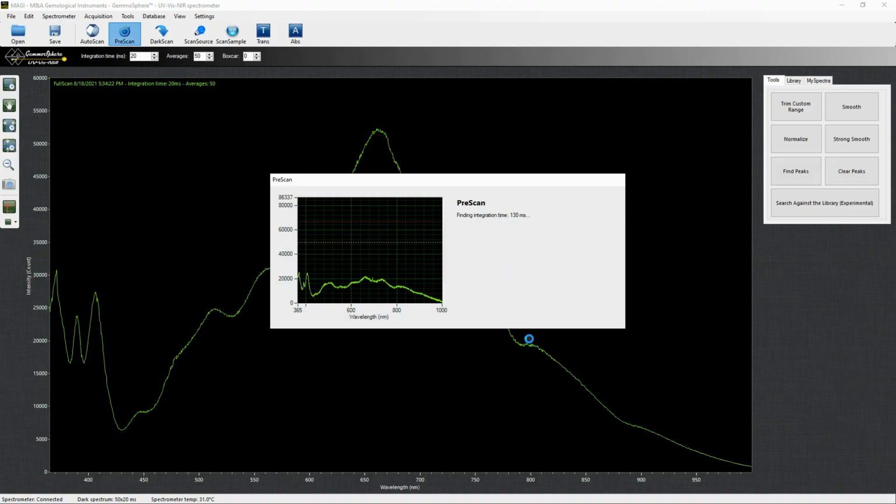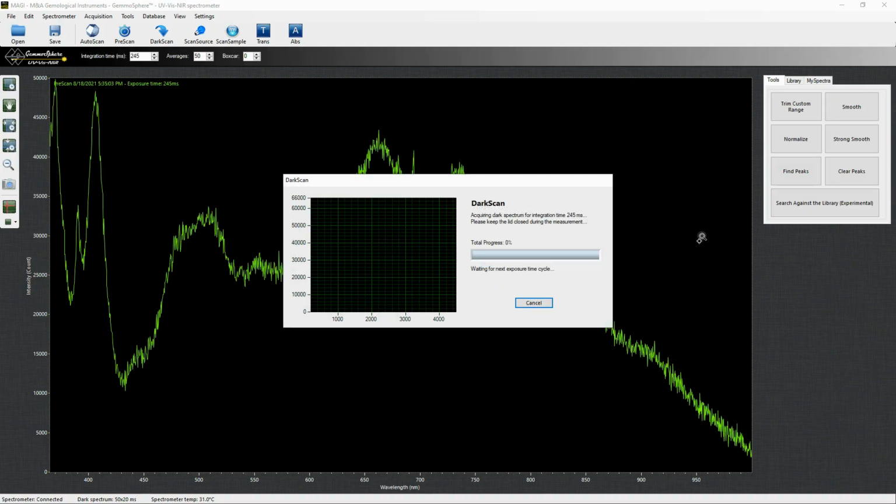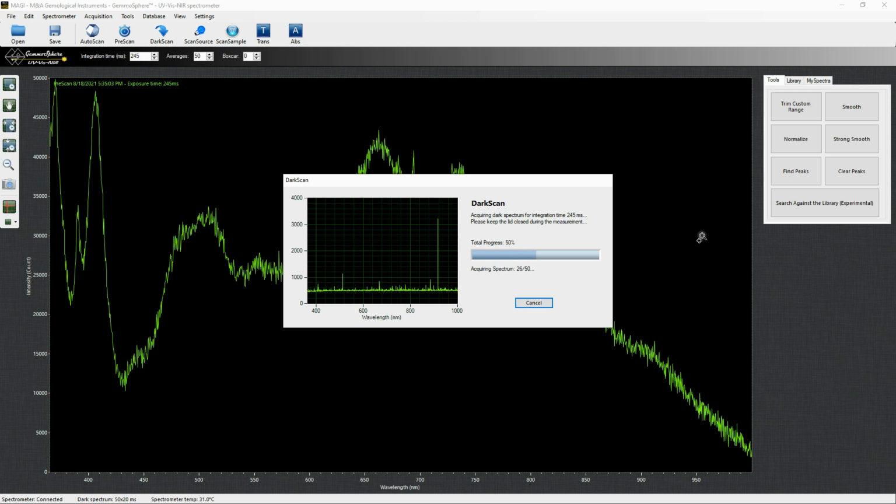After inserting the gem inside the integrating sphere, we can continue with the procedure. The unit will now run again the three aforementioned scans with the stone in place, and in a few moments we will obtain the absorption spectrum of our gem. Being the integration time directly dependent on the tone and saturation of the color, this process may vary in time from a few seconds to a maximum of a couple of minutes.